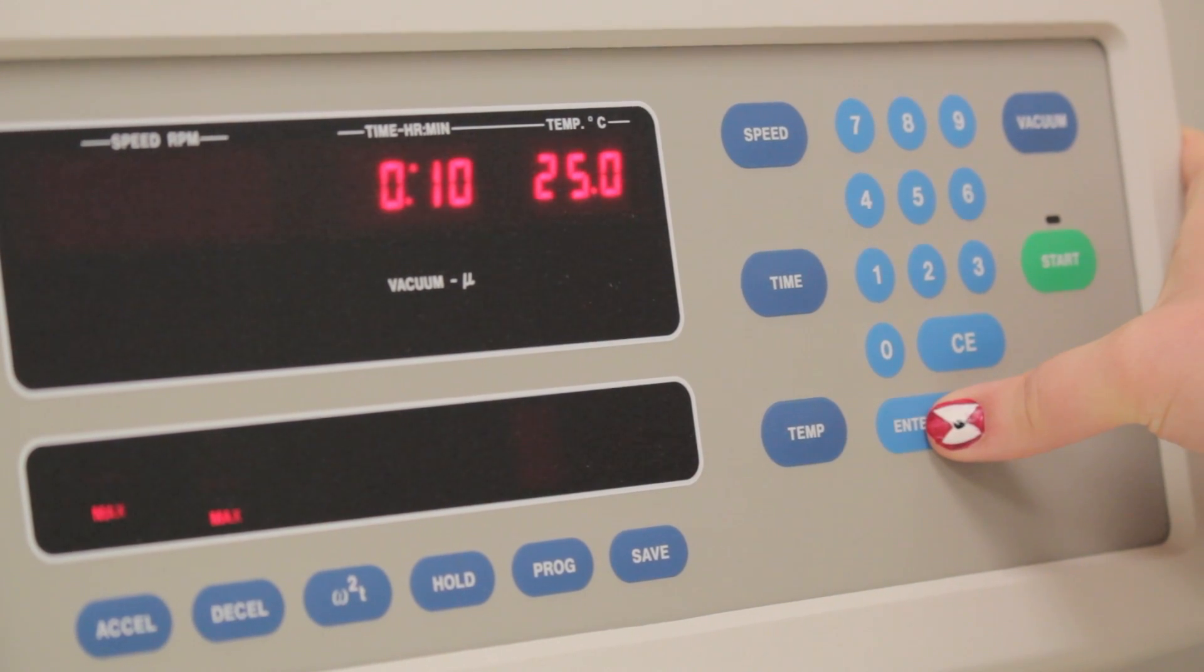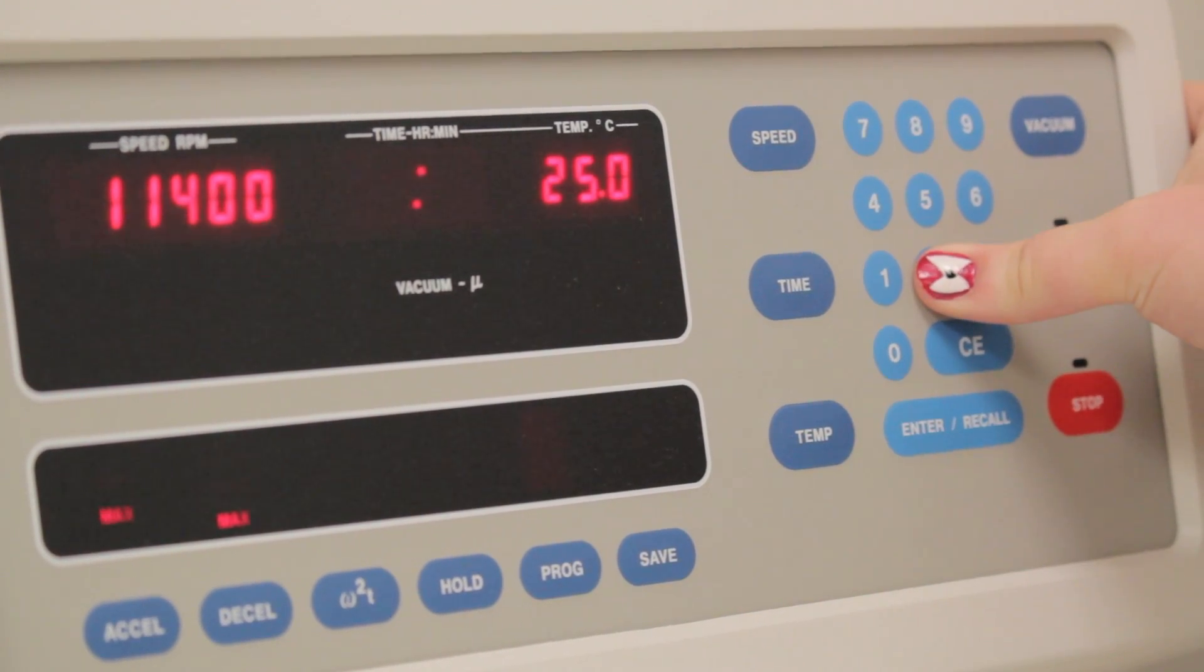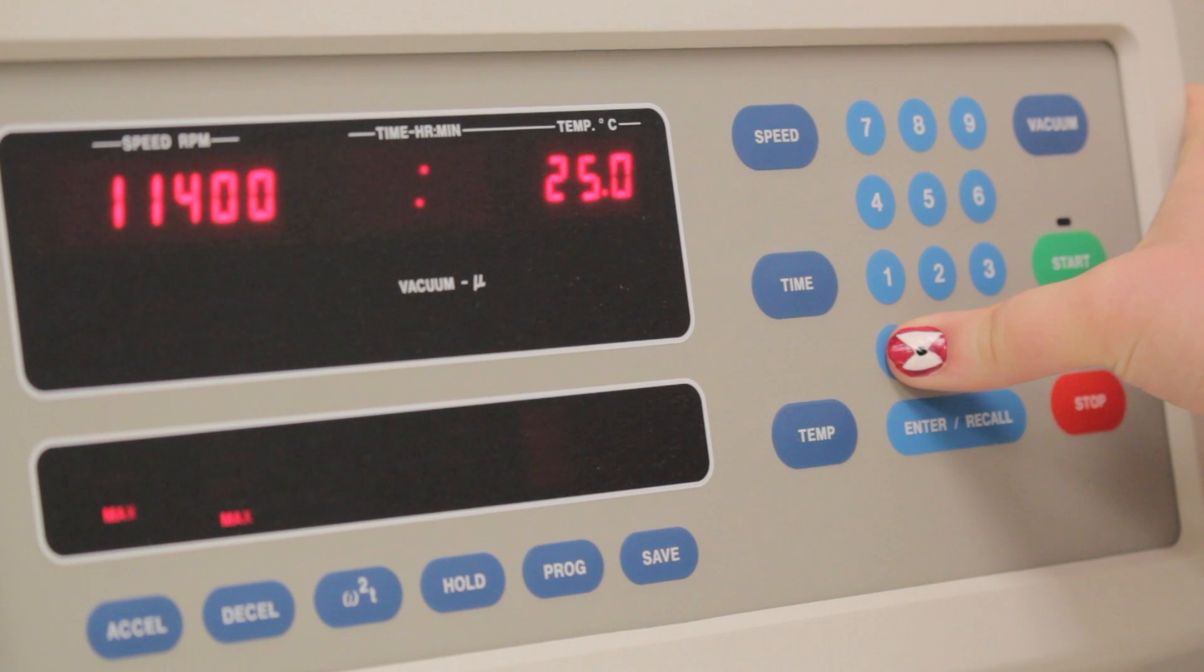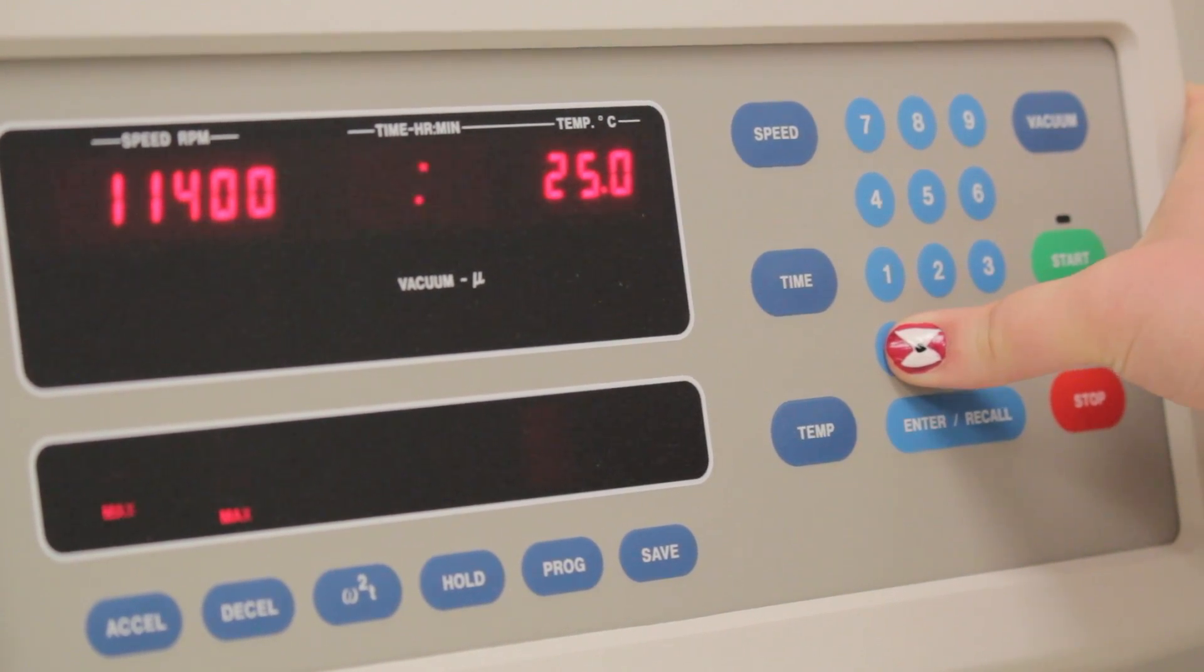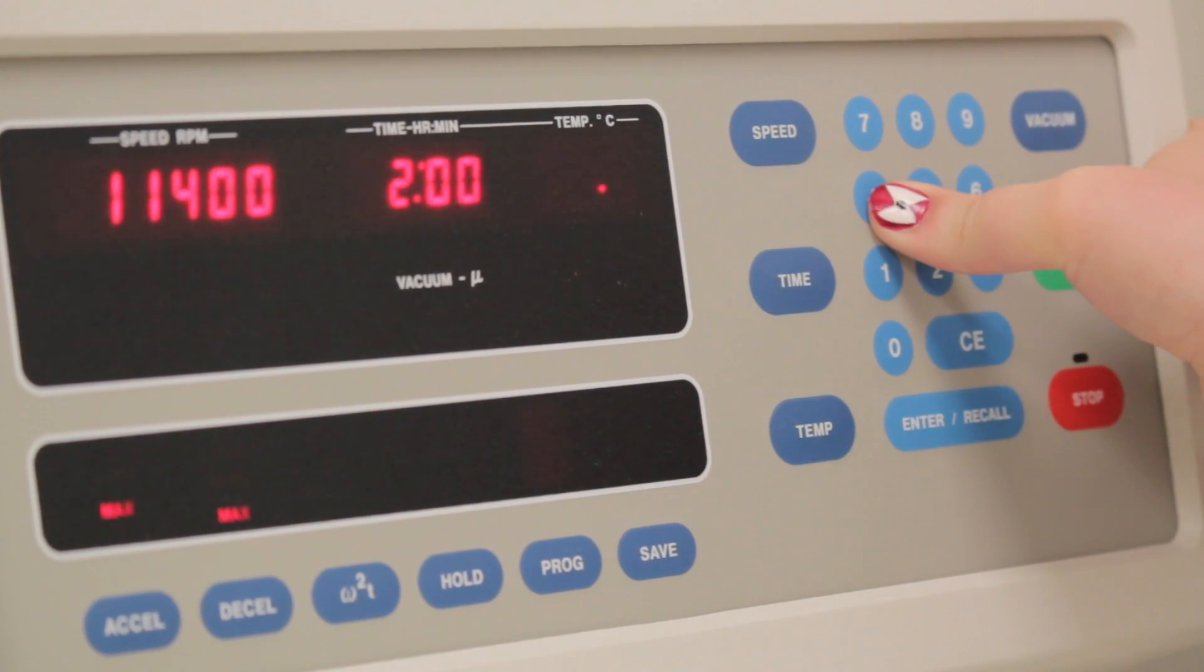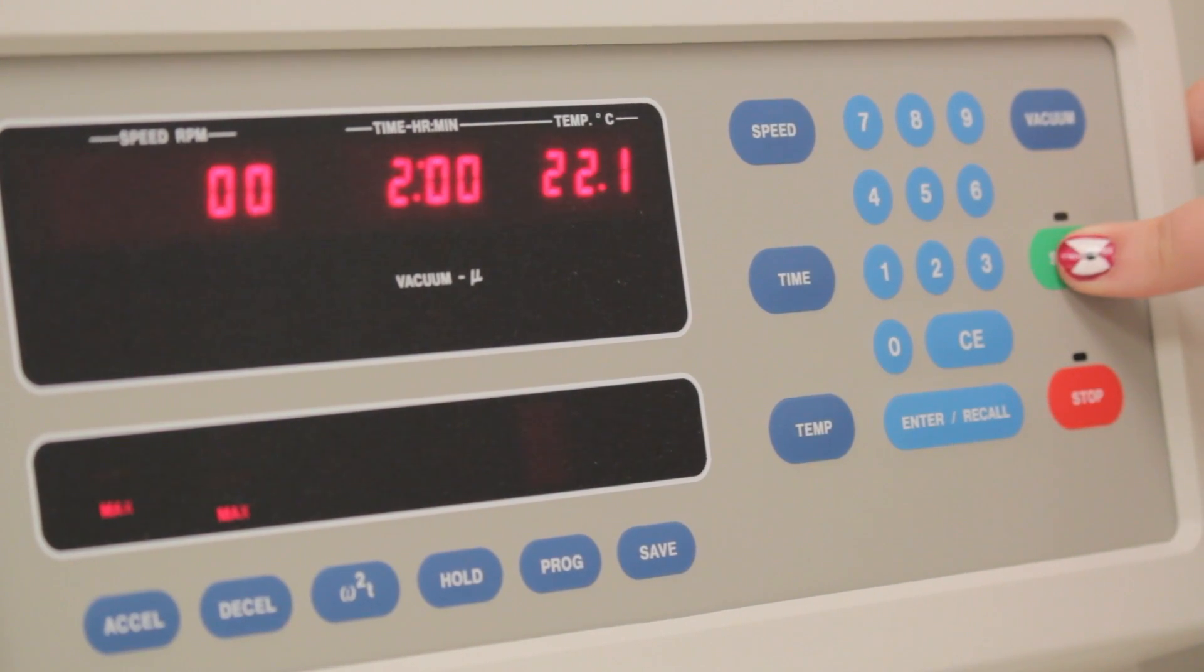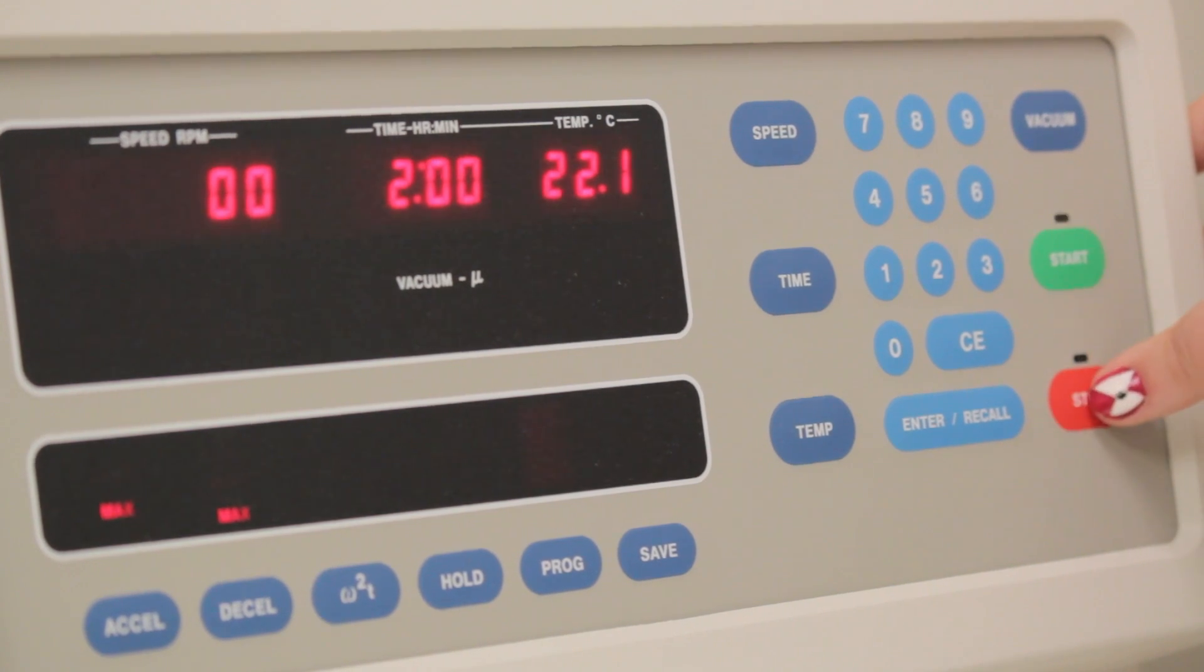Using the centrifuge, the process used in the McKay laboratory is the first spin, 2,500 times G for 10 minutes that pellets cell debris. The second spin, 25,000 times G for 1 hour that pellets organelles. The third spin, 114,000 times G for 1 hour that pellets exosomes.